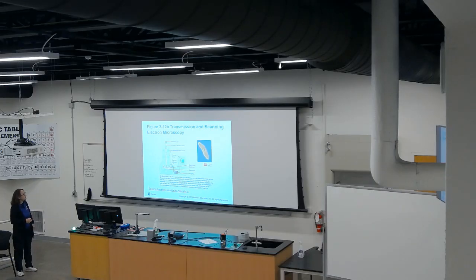So here we have this SEM. You will have your electron gun, a primary electron beam that goes all the way to this specimen here, and then the secondary electrons hit this collector or sensor for electrons. Then you go into an amplifier, and then you can see your image in the monitor of your computer, and then you take a picture of that image.